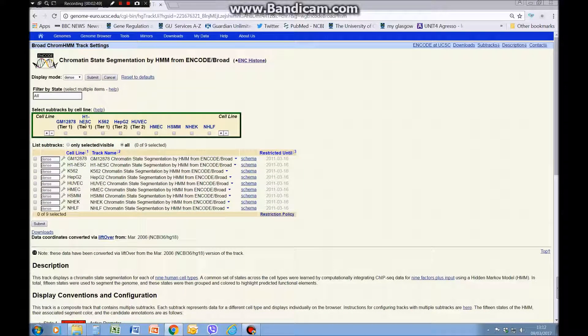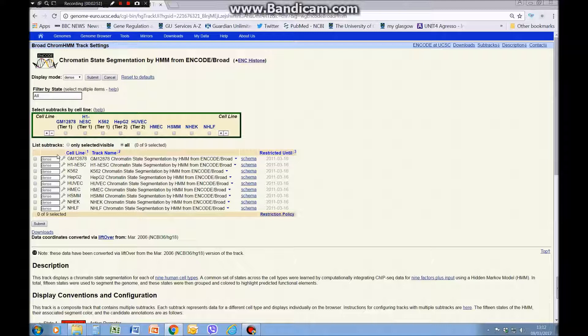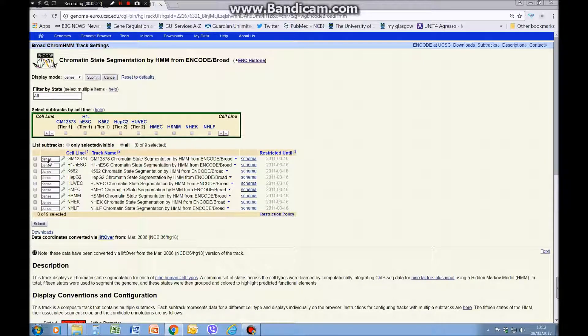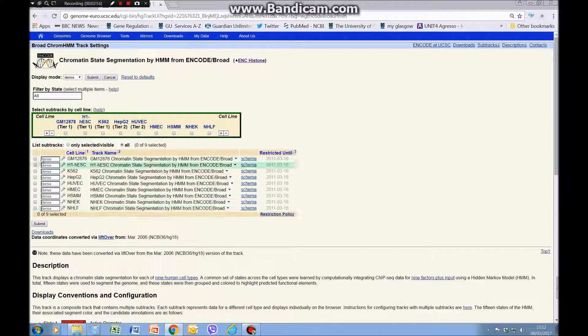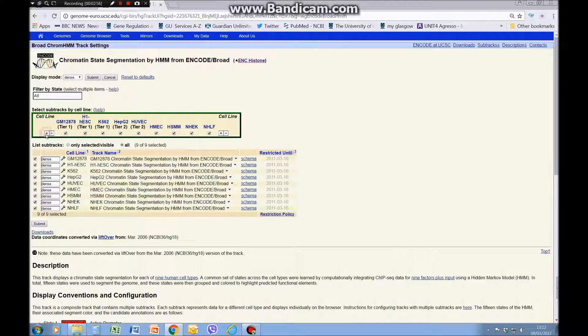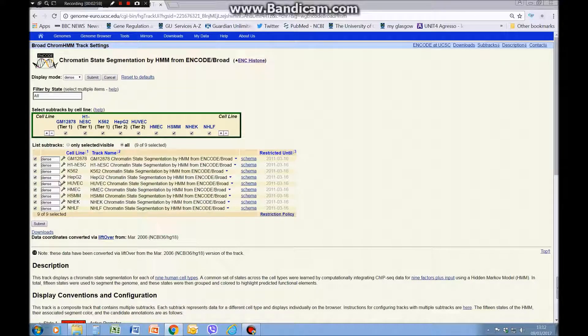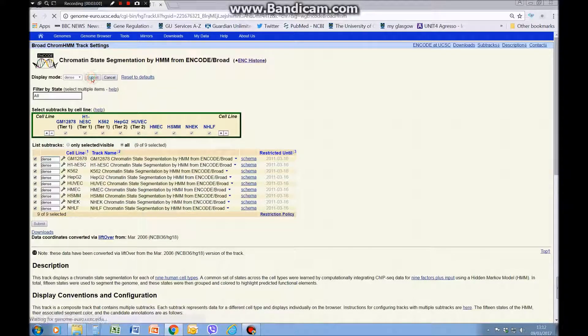We'll set it to dense and click that on, and click these to hide. If we click on that track title we can see the different cell lines that they did this on. For starters we're going to look at all of them, so you can click them separately or we can just click the plus there and that selects them all, and then we're going to submit.